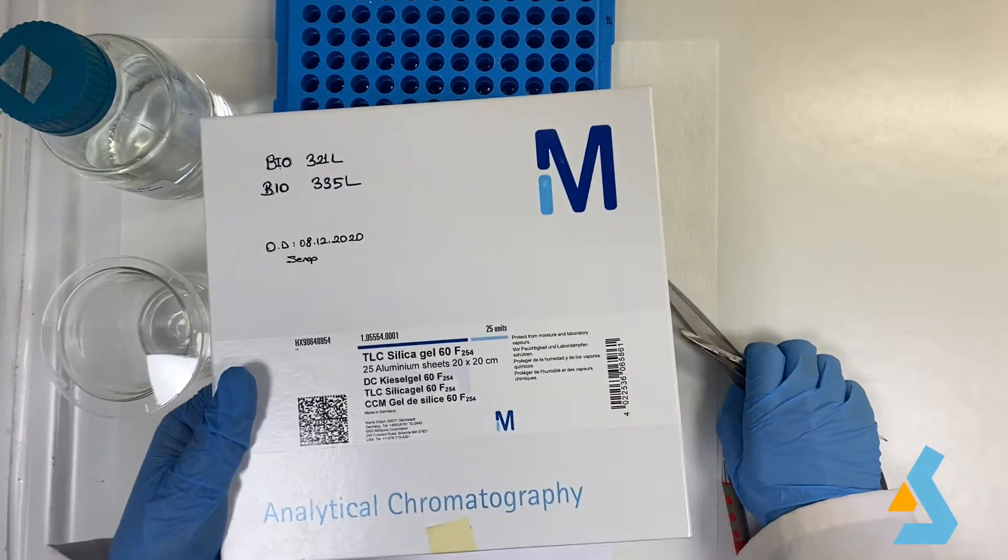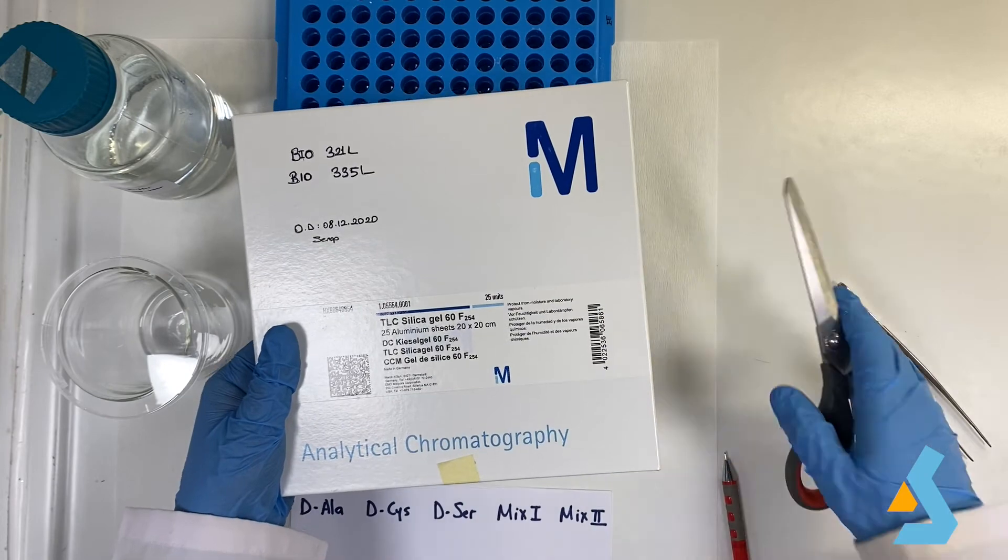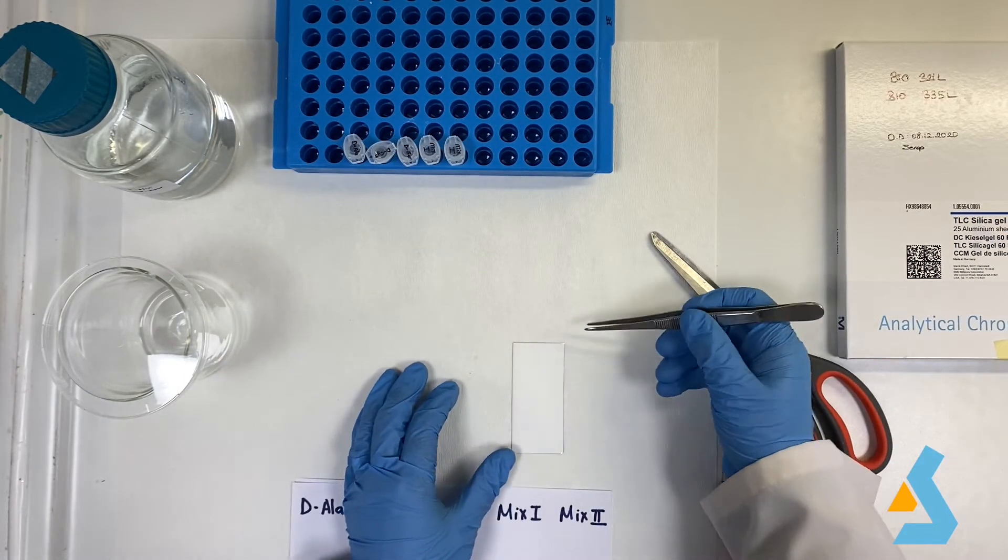In this experiment, we use thin layer chromatography silica gel 60 by Merck. We cut this rectangular shape piece for our experiment.